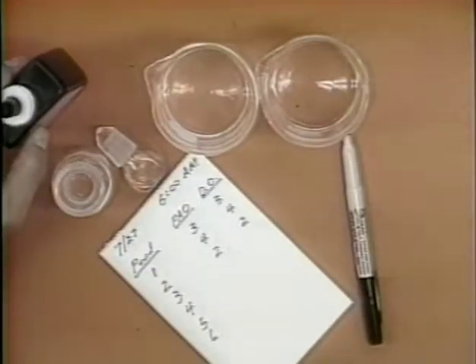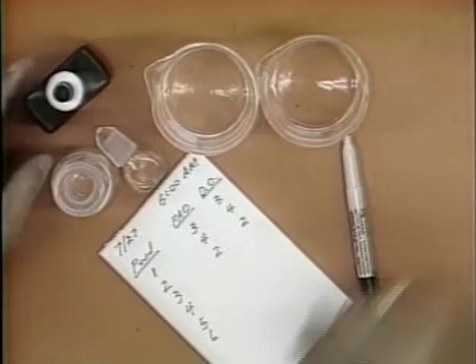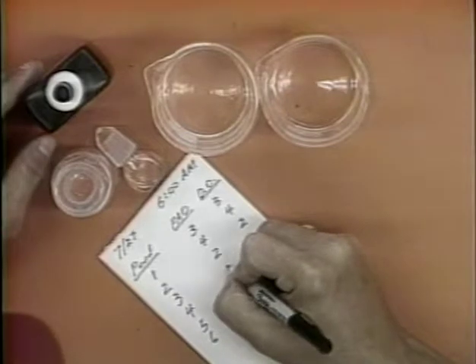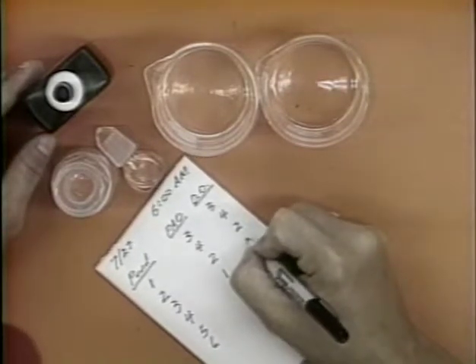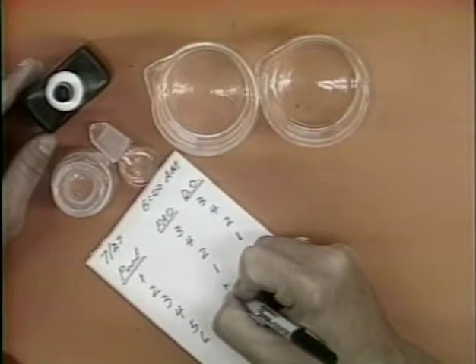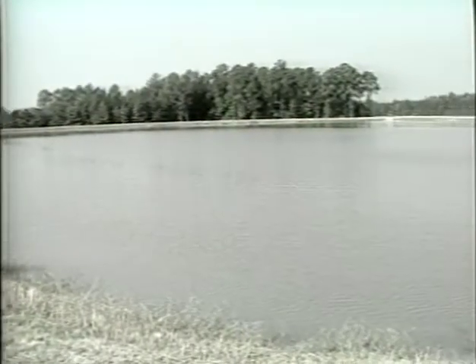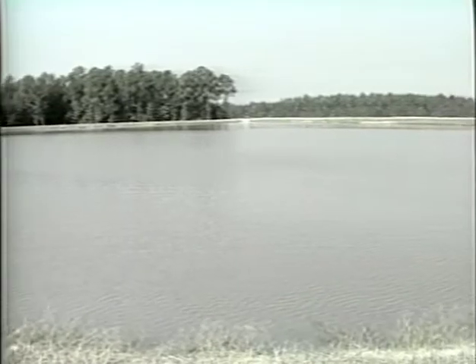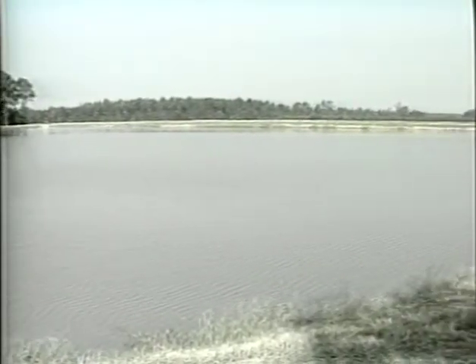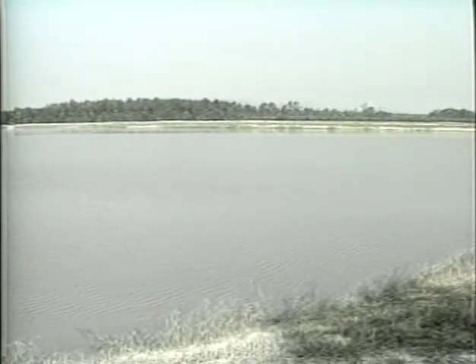During the summer, dissolved oxygen should be recorded twice daily, ideally at dawn and dusk. Records should be kept which may indicate trends which may affect fish if corrective measures are not taken. During the cooler months, where there is less danger of oxygen-related fish kills, measurements may be reduced or discontinued, depending on the stocking density of the pond.